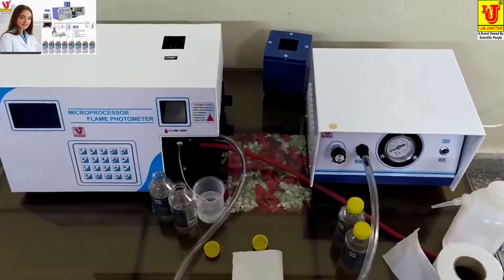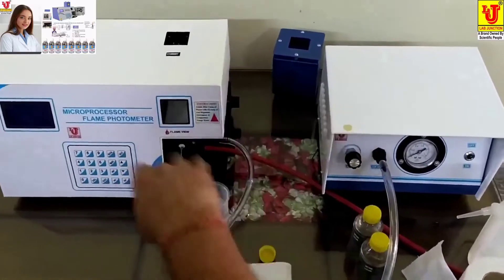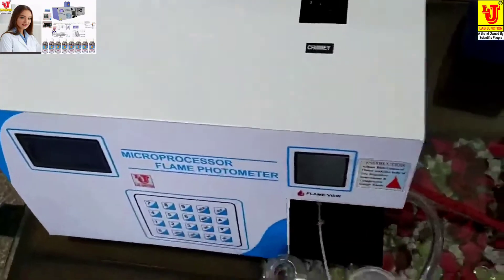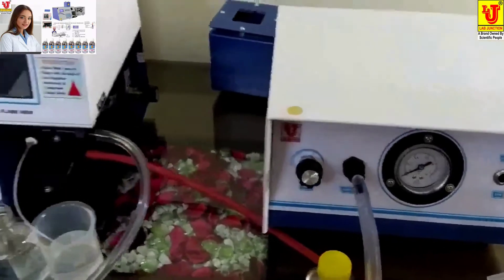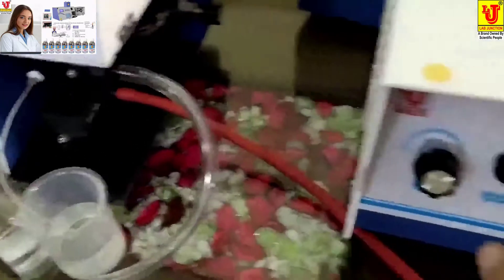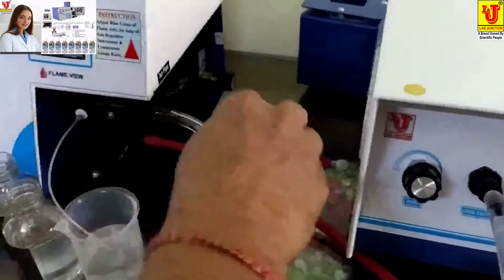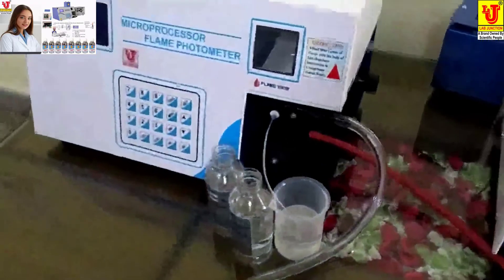Lab junctions microprocessor flame photometer — this is the complete unit. Unit one is the main unit, microprocessor flame photometer, and unit two is the compressor. First of all, you have to connect the air pipe to unit one and the air pipe to unit two, and completely tie this. This is the drain pipe — it goes to drain.